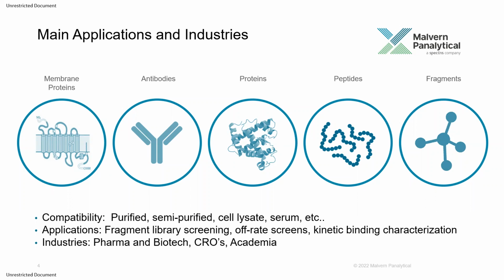They use the WAVE rapid feature, off-rate screening, to full kinetics binding characterization. So ultimately, with the instrument, you can get on and off rates, ultimately allowing you to calculate binding kinetics and also affinity.